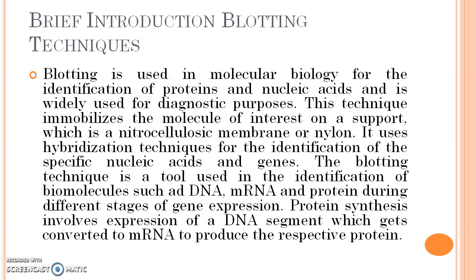Blotting is used in molecular biology for the identification of proteins and nucleic acids and is widely used for diagnostic purposes. This technique immobilizes the molecule of interest on a support, which is a nitrocellulose membrane or nylon. It uses hybridization techniques for the identification of specific nucleic acids and genes. The blotting technique is a tool used in the identification of biomolecules such as DNA, messenger RNA, and protein during different stages of gene expression.